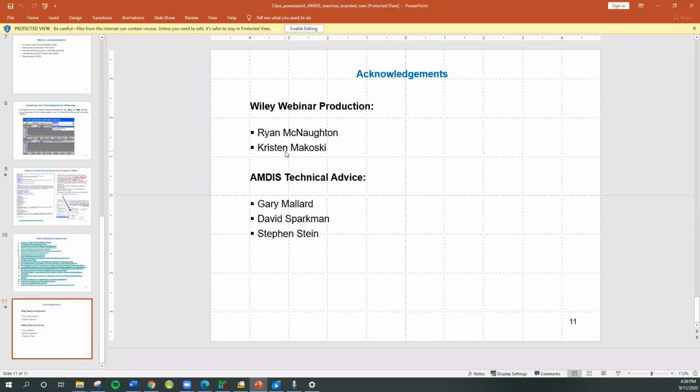And I really just want to say in conclusion that I think you'll find AMDIS very useful for processing complex files and simple files, because it just does such a good job of deconvoluting things that you can't background subtract yourself. But you know, you can still use your regular software if you want to, but it's a real valuable tool, and it's very interactive with the NIST search, and it does its own internal searches that are very, very fast if you just want to survey things quickly and not send everything out manually to the NIST search.